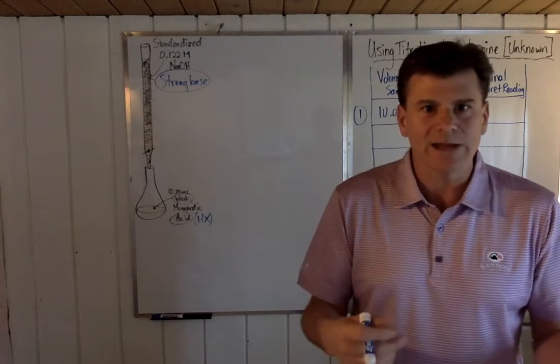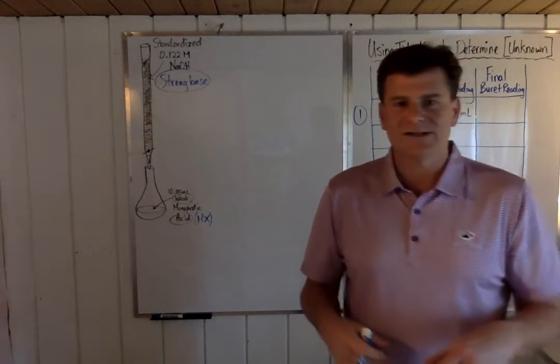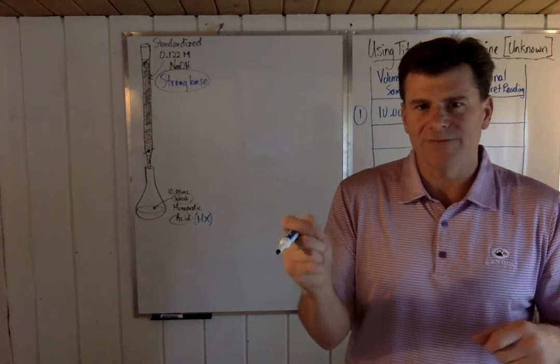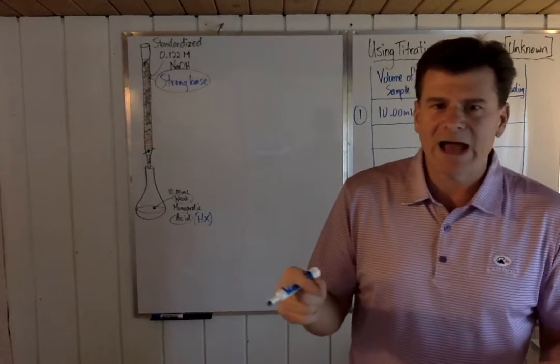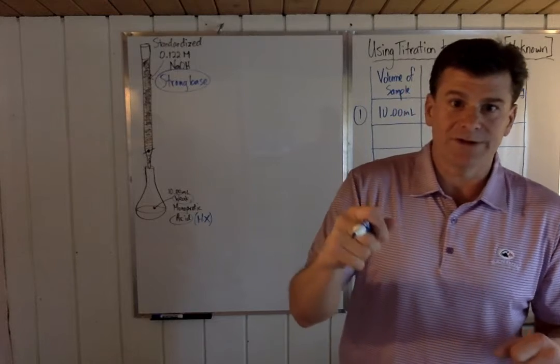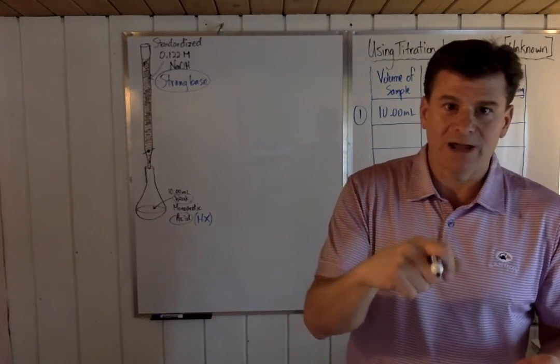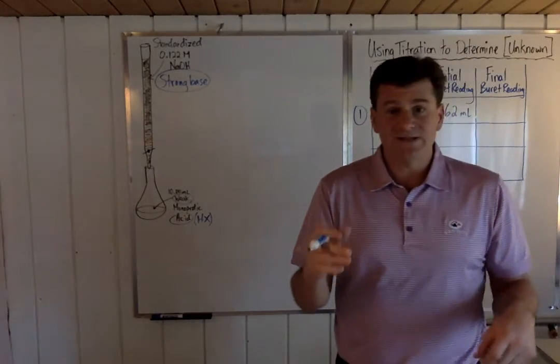But then you had to wait like a second before it actually started to disappear, you had to swirl it around. Well, that's when you need to start tailoring the valves so that it starts going drop by drop. And not only that, but it should probably be drop, close it, swirl it around, drop, close it, swirl it around. And you're trying to get the drop.